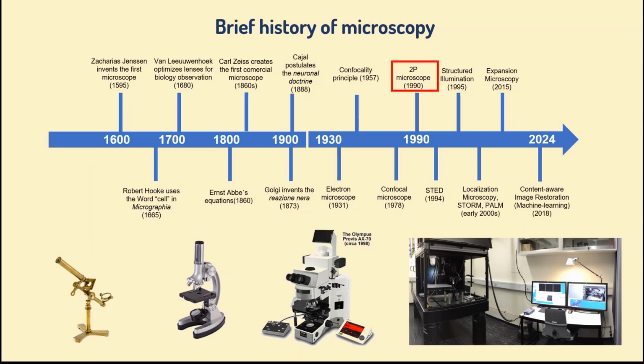The two-photon microscope was invented in the 90s. Actually, further down the talk, we will see the history of two-photon microscopy, and we will see that it started in the 30s actually. The first two-photon microscope was invented in 1990.